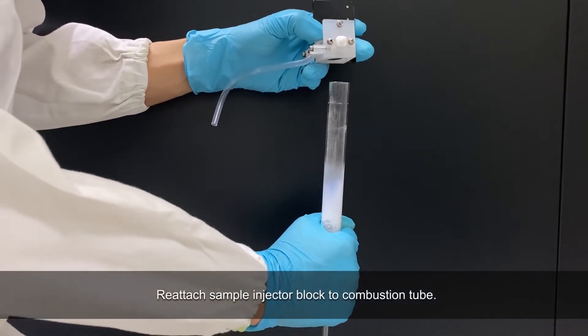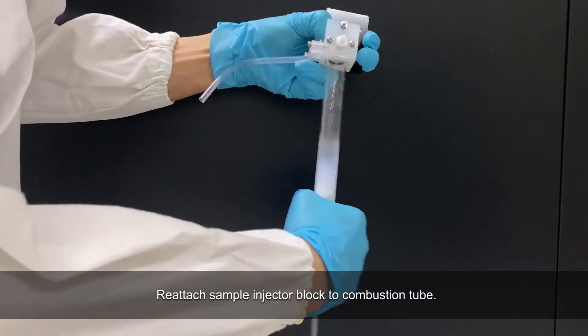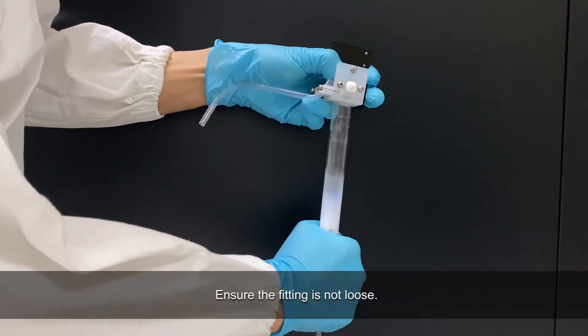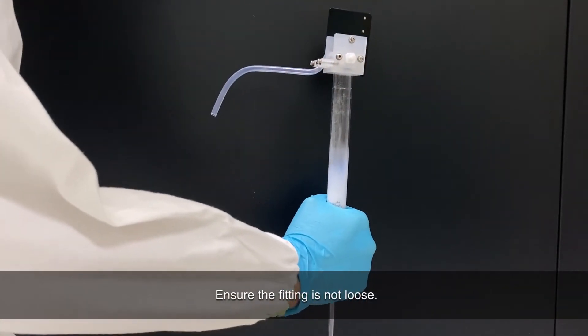Reattach the sample injector block to the combustion tube. Ensure the fitting is not loose before proceeding.